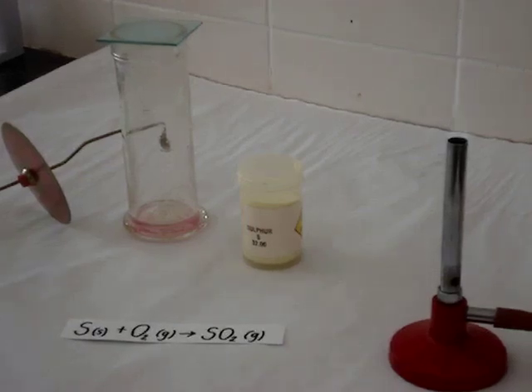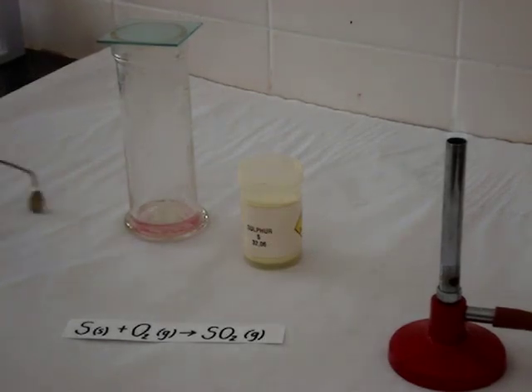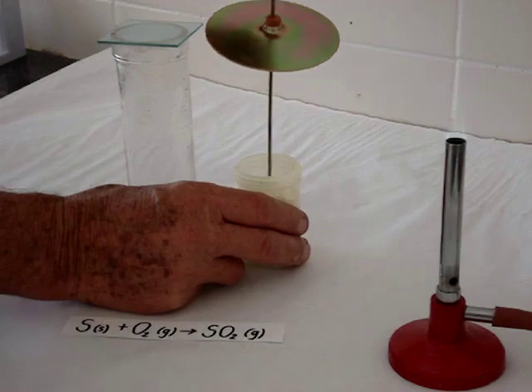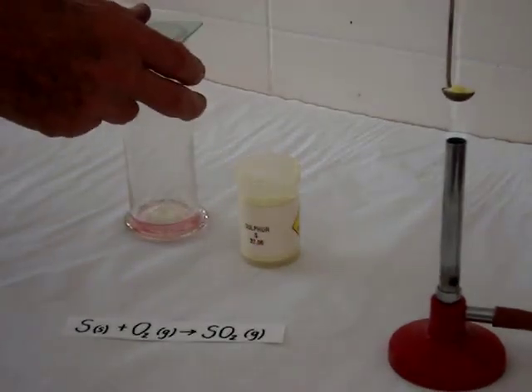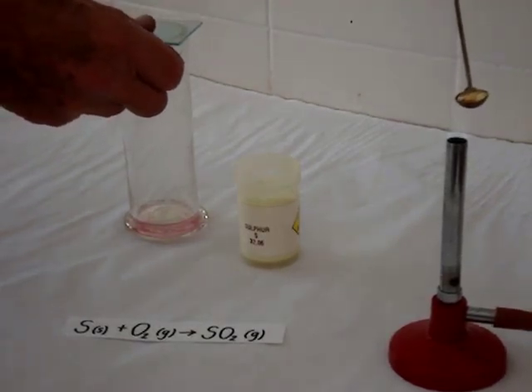Sulfur is a yellow non-metal. We are going to burn it in oxygen. We take a little bit in this deflagrating spoon and we heat it in the flame of the Bunsen burner, and then we're going to plunge it into oxygen in that gas jar.